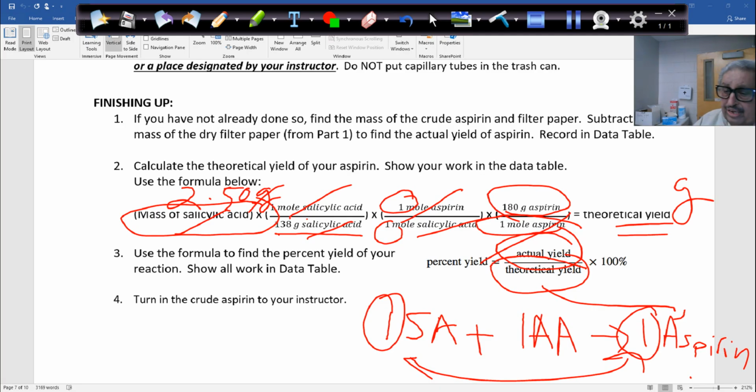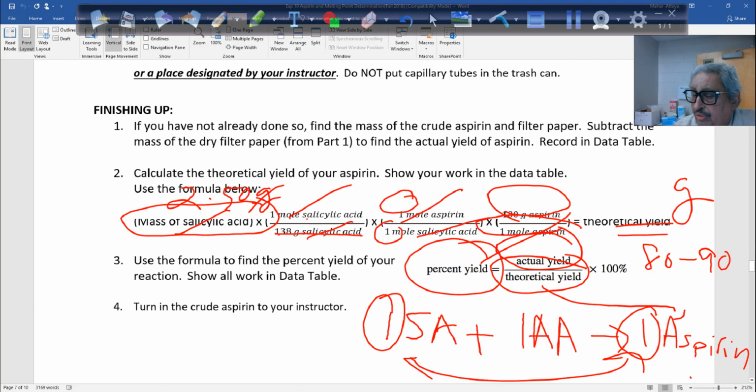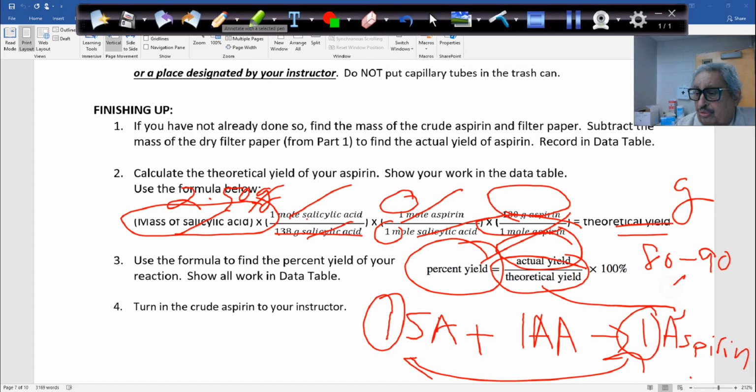Okay, guys? And then with the percentage yield, we can look at the whole thing. Usually, the aspirin experiment is straightforward. You can get about 80 to 90% yield. It's a straightforward reaction and it's very quick, but then the dryness takes time. Once it's dry, you keep it overnight, or you keep it for 1 week, and the next week you can come and calculate.